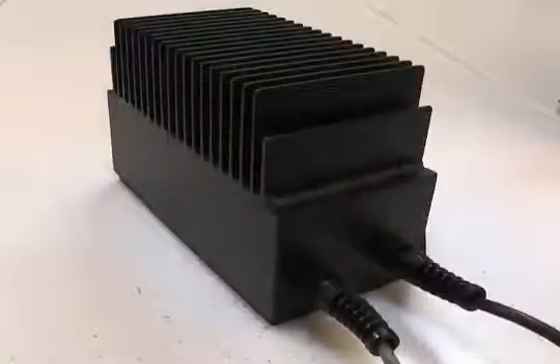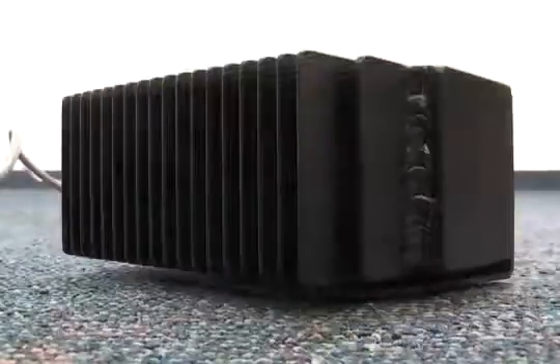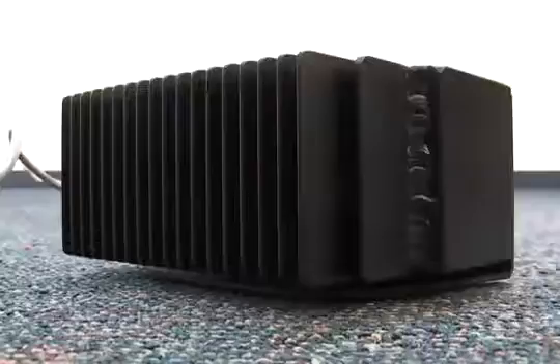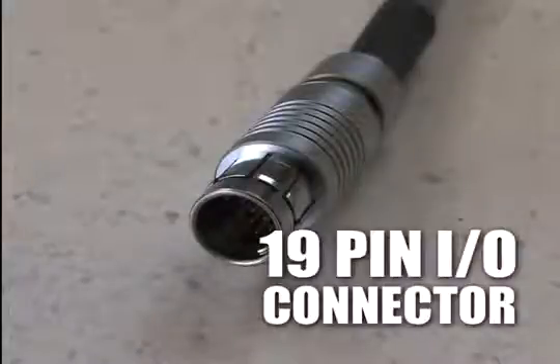The CMS5000 is 120-volt and 240-volt compatible. It uses a weatherproof AC-DC converter with a built-in surge protector. The instrument can be integrated into a SCADA system using a 19-pin I/O connector.